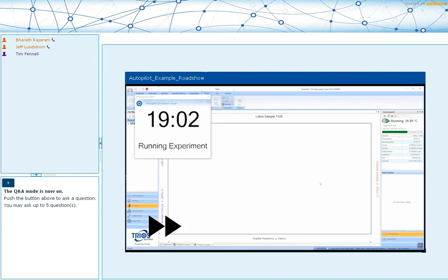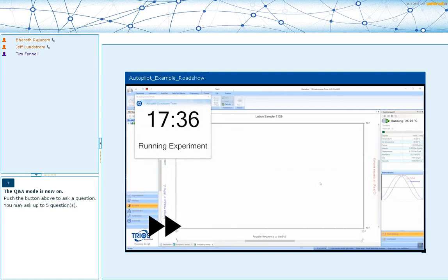This particular user is testing a purple hand soap. They enter the sample information, operator initials or name, and then we give them an opportunity to review the test parameters. And it's important because in the shared use facility, we start with a general set of parameters that works for most users, but then we give them the option to change this as needed.